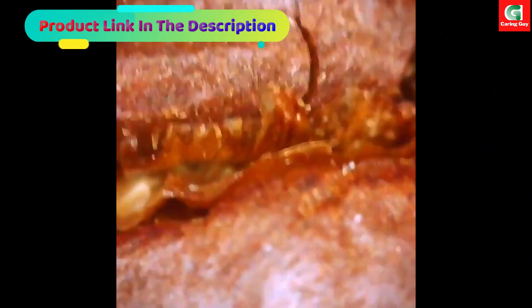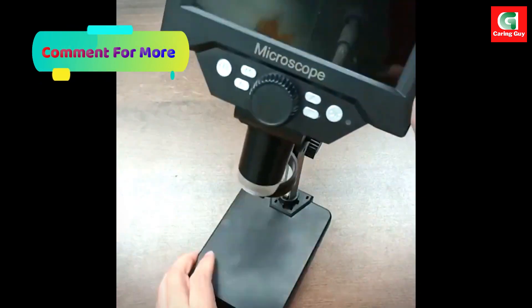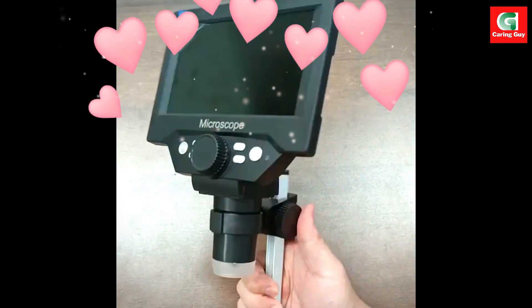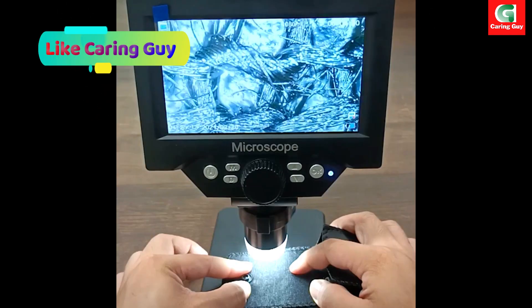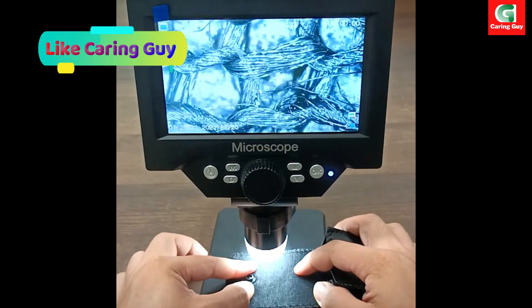High magnification ratio: the microscope boasts an impressive magnification ratio ranging from 500x to 1500x, allowing users to obtain clear and detailed images of their subjects. This high magnification capability is particularly useful for tasks that require precision and close examination, such as electronics repair and intricate observations.